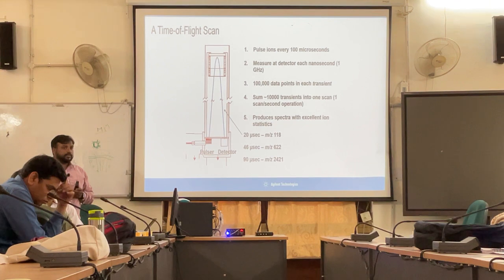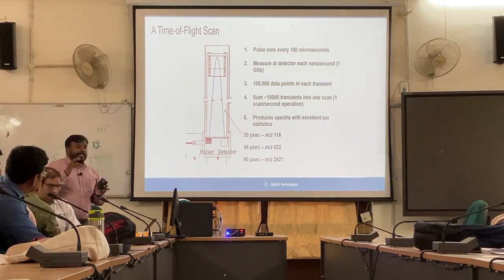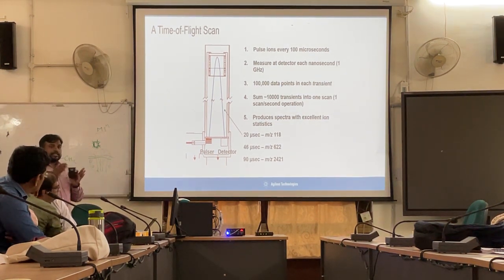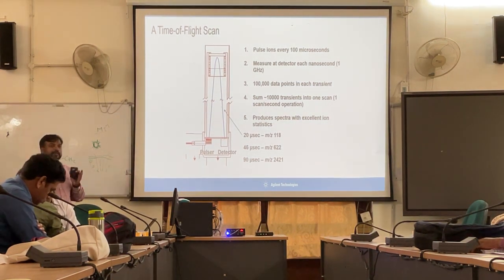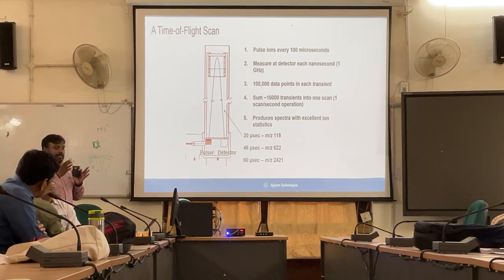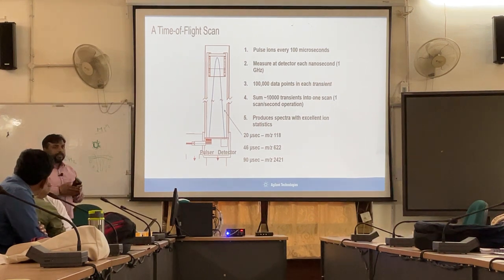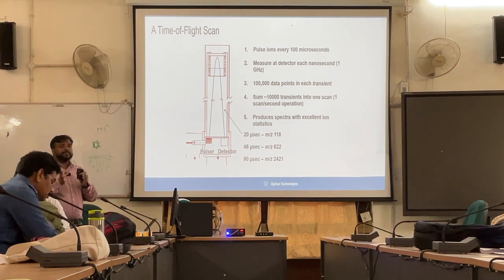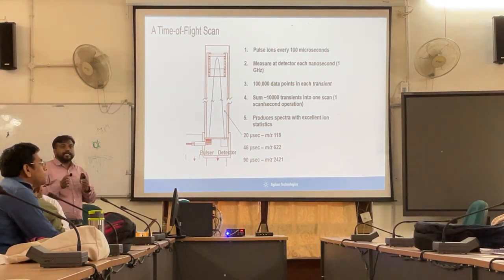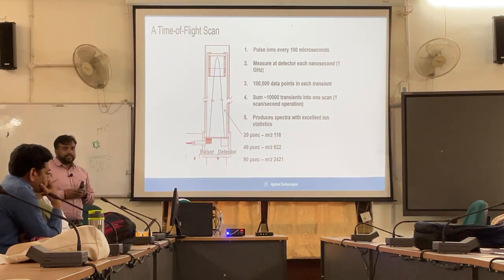If the instrument was idle for a month, then first of all we have to calibrate the instrument. There are two modes of calibration. One is the quadrupole calibration, another is the TOF calibration. If we are doing the TOF calibration on a daily basis, in the quadrupole calibration we are actually adjusting the voltages. The quadrupole principle is that RF and DC, radio frequency and direct current, are set. And we assume that would only be needed once there is some malfunction with the instrument.